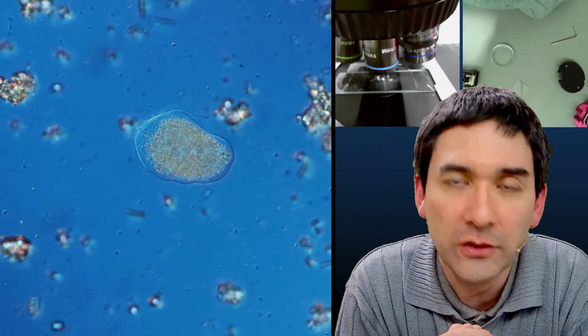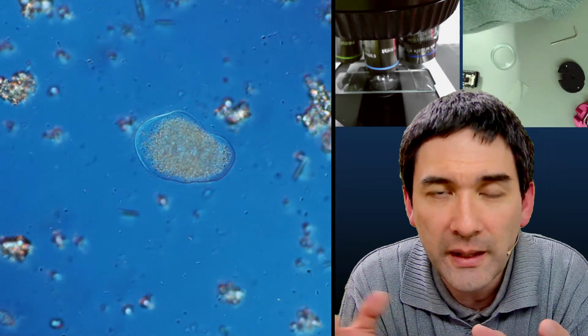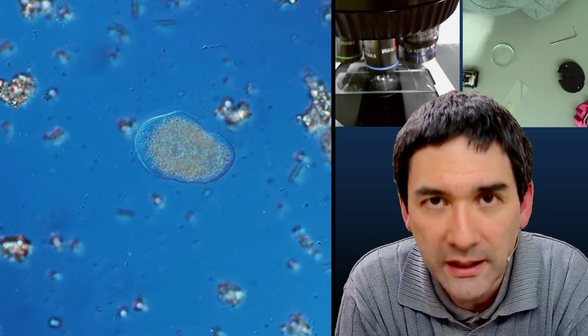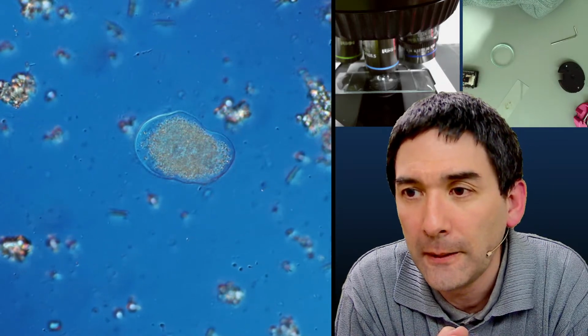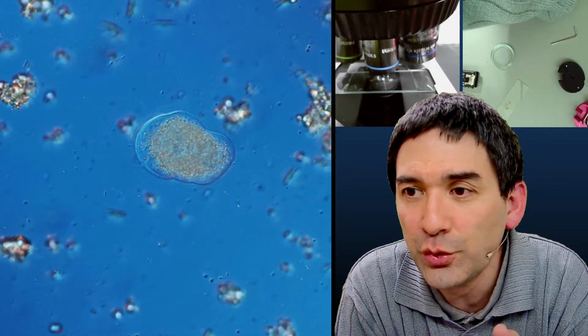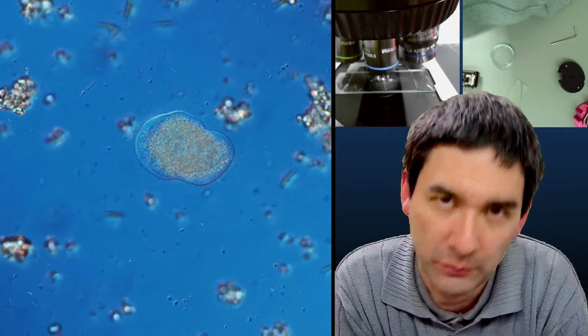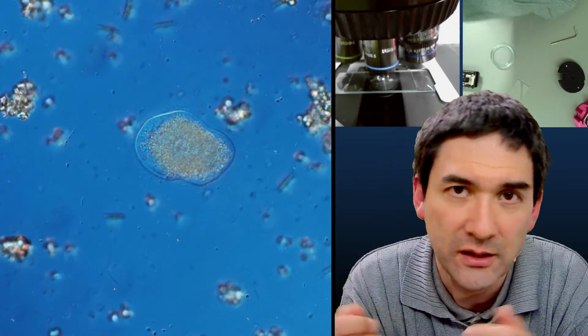The reason why you want to do that is so that you reduce any excessive light on the slide, which might introduce stray light. And so it increases the contrast a little bit. So the question is do you calibrate your scope often? No, I don't calibrate it often. I just look through it, and if I see it's off center, I quickly adjust it. So it takes a couple of seconds.